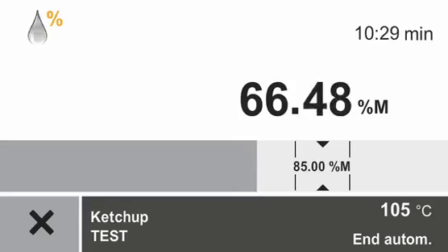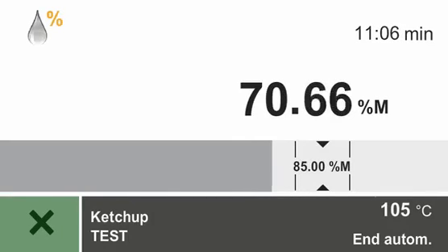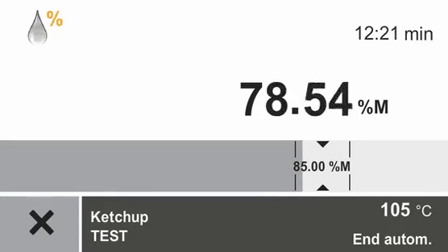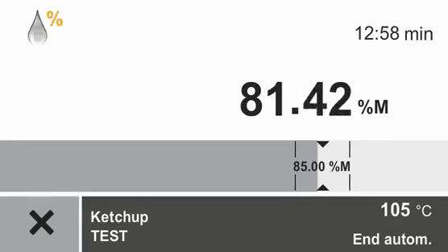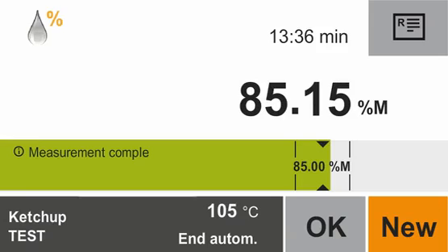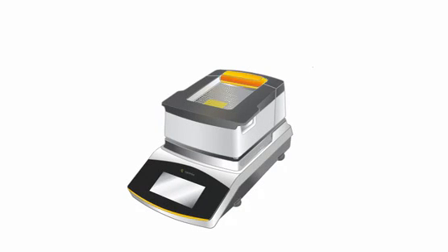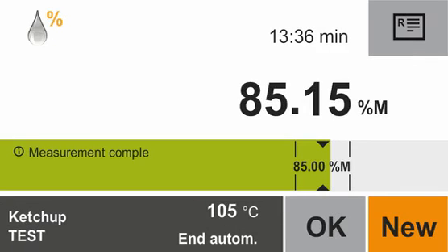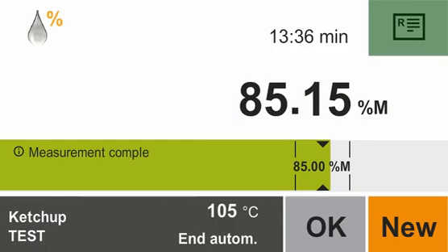You have the option at any time to terminate the measurement prematurely by pressing the stop button. When the moisture analysis is completed, you hear a signal. The light flashes three times and turns off afterwards. The results of the moisture analysis are displayed. This sample has a moisture content of 85.15%. You have the option to get a printout of the protocol of the actual measurement via the report function.